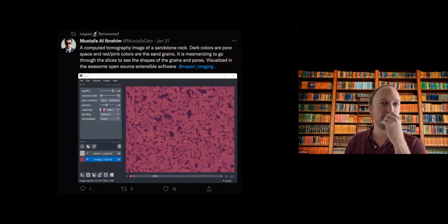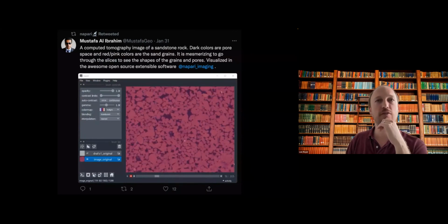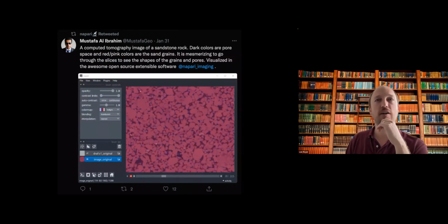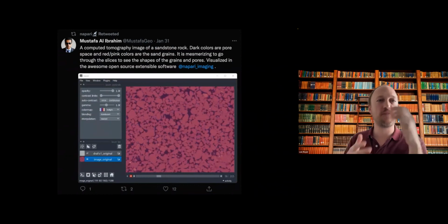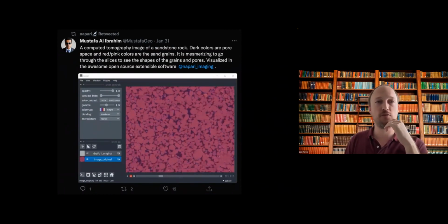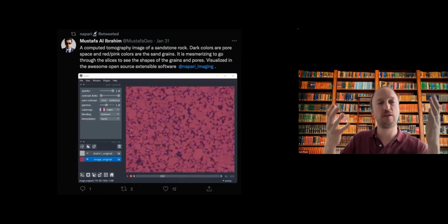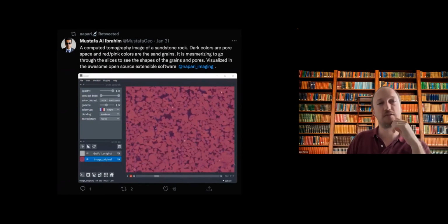Material sciences here, for example, people are also starting to play with Napari in other fields, using all the features that we developed for bioimaging, but that are to a large extent universal to images and overlaying data and processing the results of analysis on top of this data and so on and so forth.